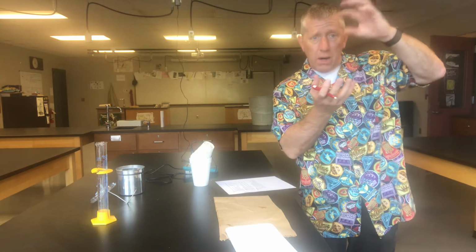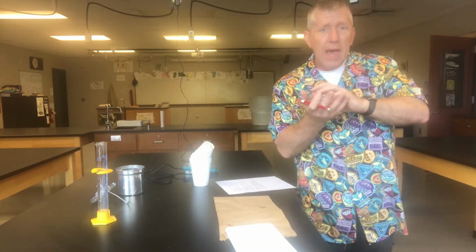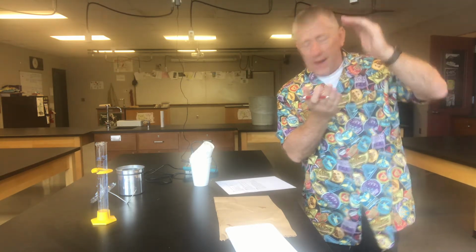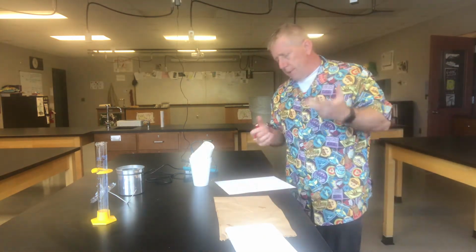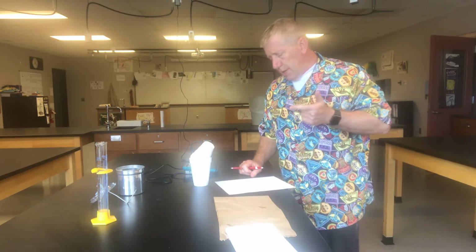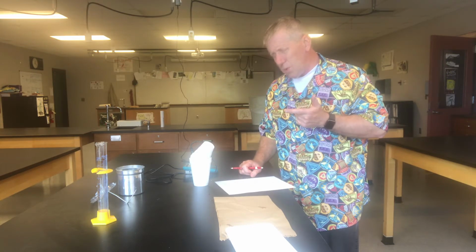It was really hot water and then went, as the ice cube was melting, getting colder and colder, of course, because the ice cube was cold. And we get this final temperature of the hot water. So we went from 43.4 and we're going to subtract 18.5. You do the math on that: 43 minus 18 would be 25, but one less than that, so 24.9.